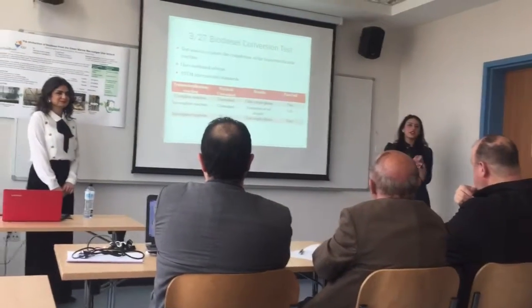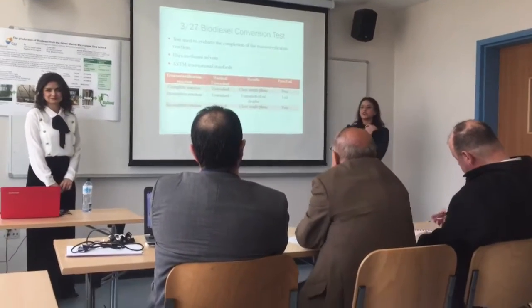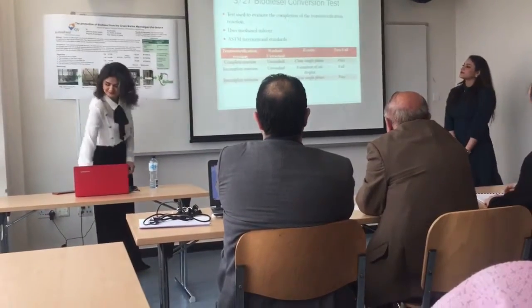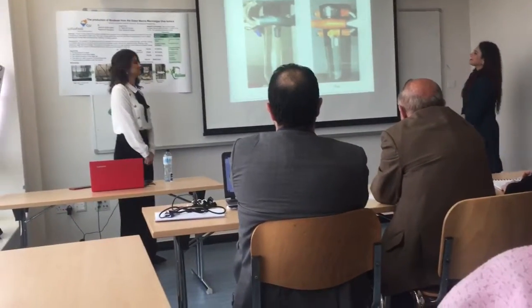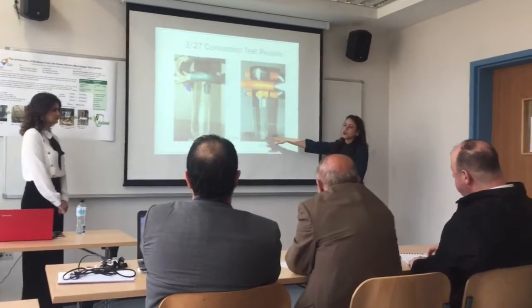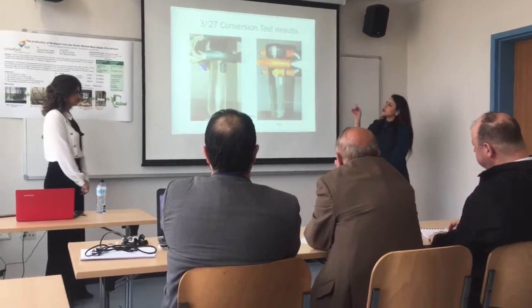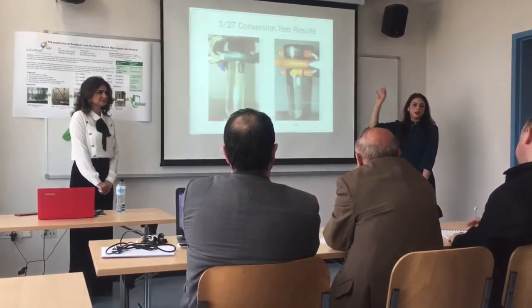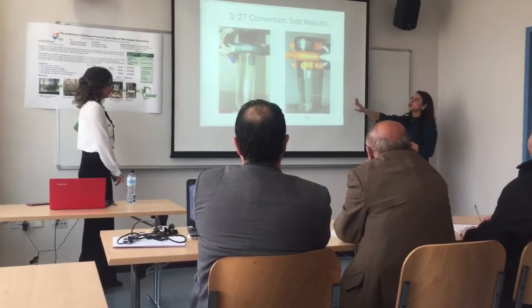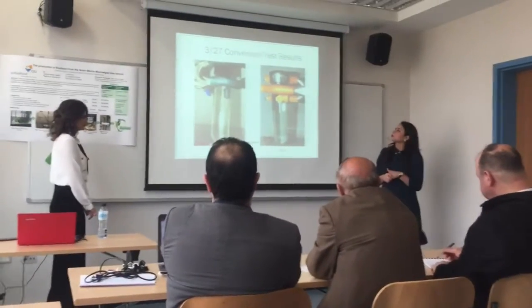There are international standards organizations that evaluate different standards for different materials, products, and services. Here you can see results of our test. So the passing result would be a clear phase, whereas the failing result sometimes gave us oil droplets. The biodiesel result we mentioned within the presentation was used to check the yield percentage. We chose only the tests that passed for the optimal results of our experiment.